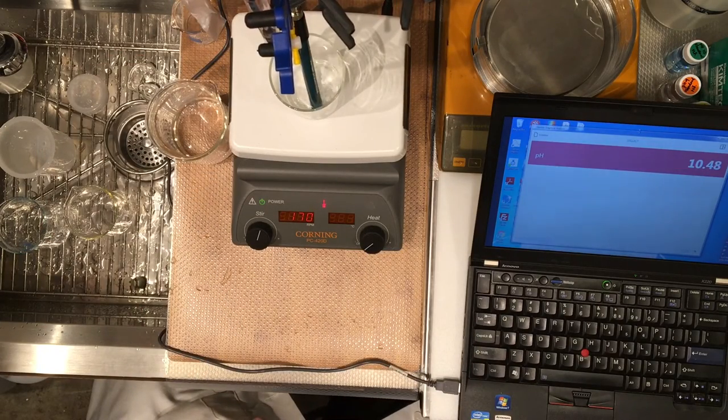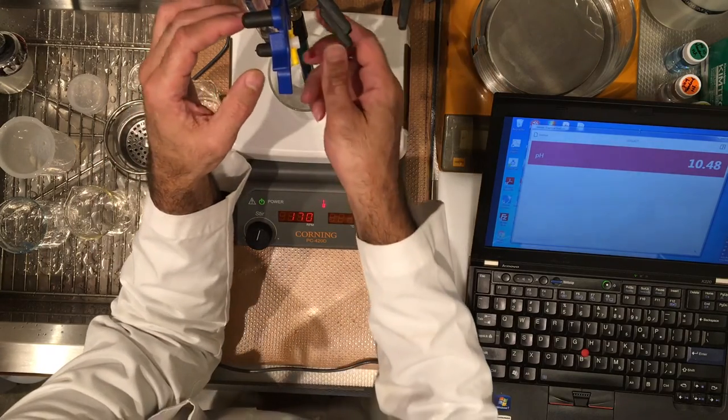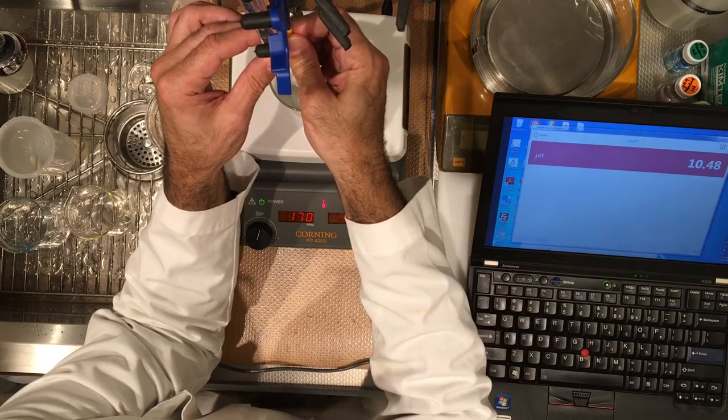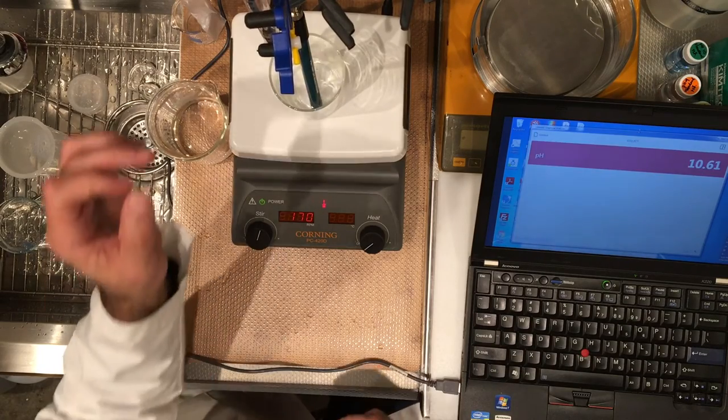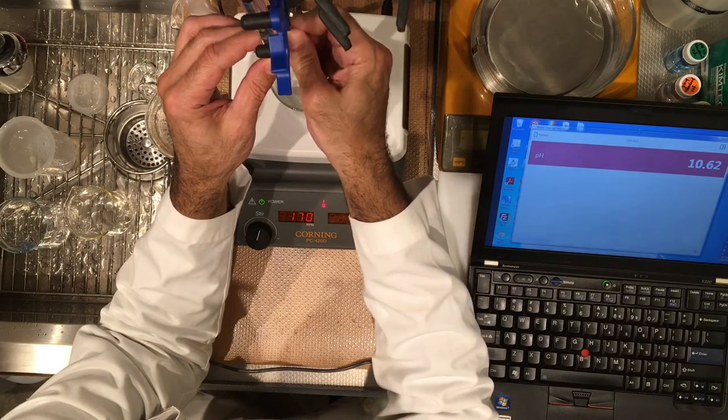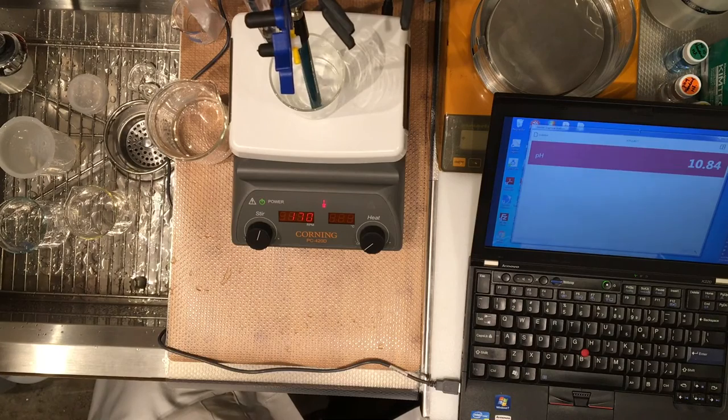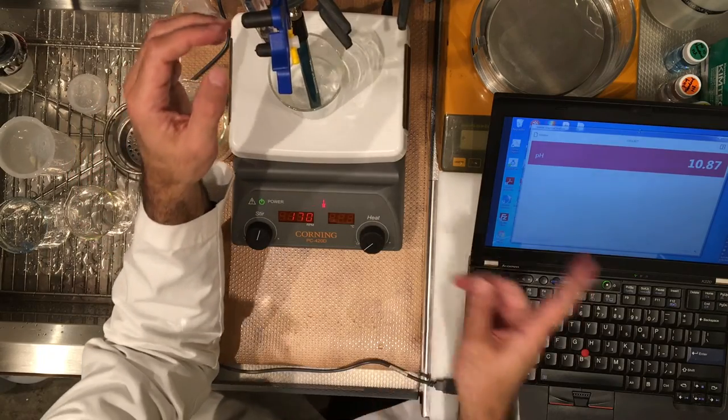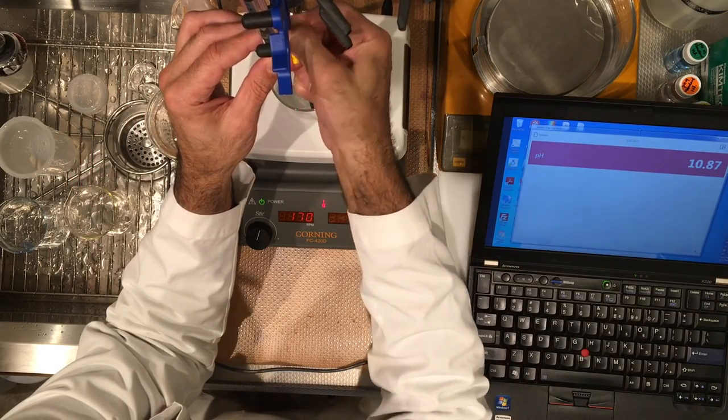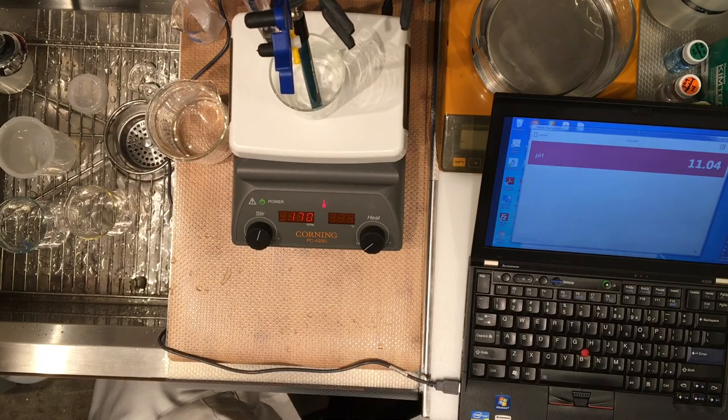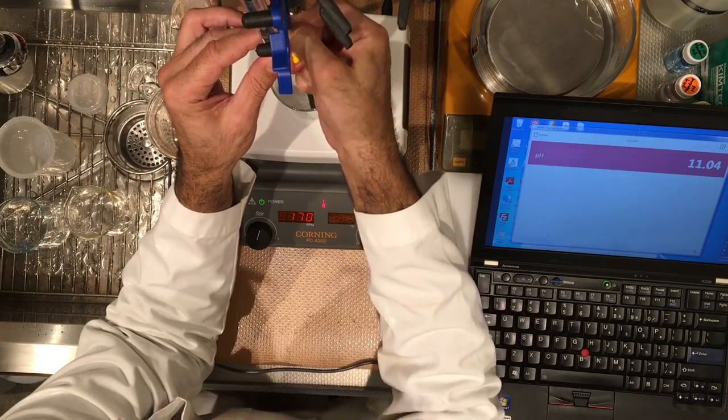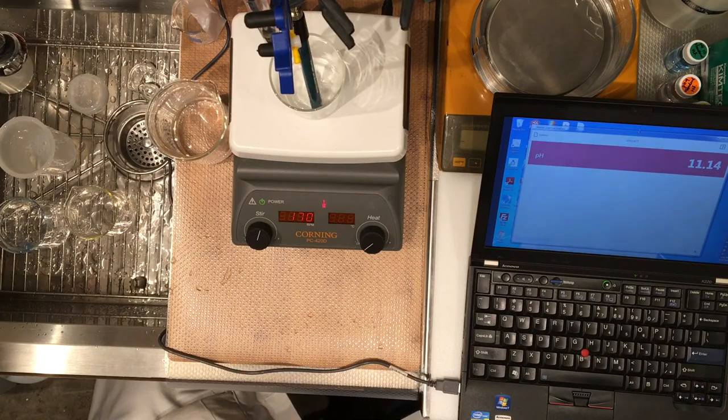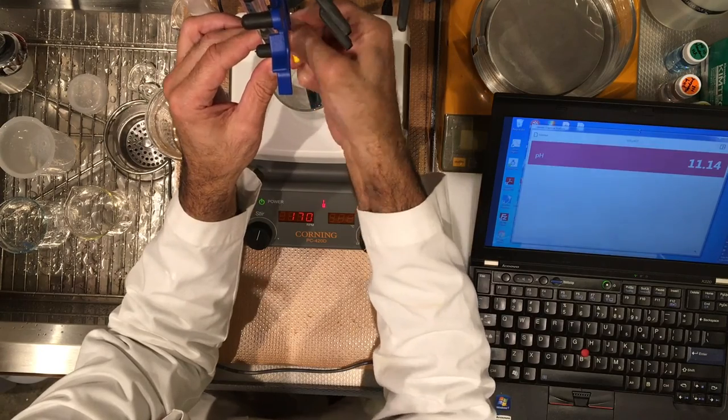12.00. Record 12.50 so we can go back to 0.5 milliliter increments record 13.00. Record 13.50 record and the last one 14.00.